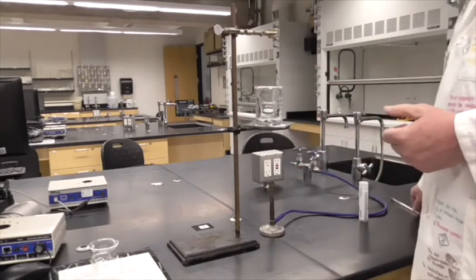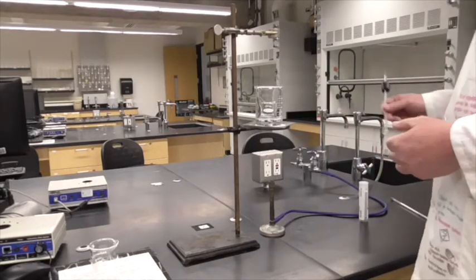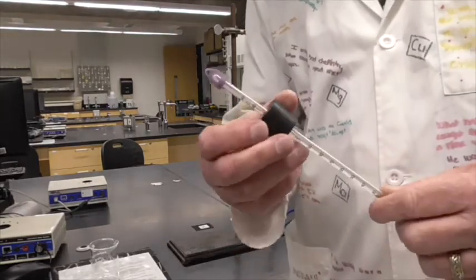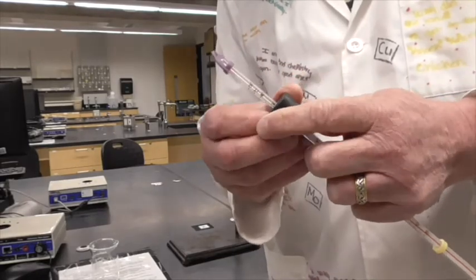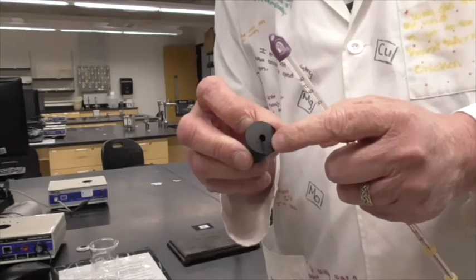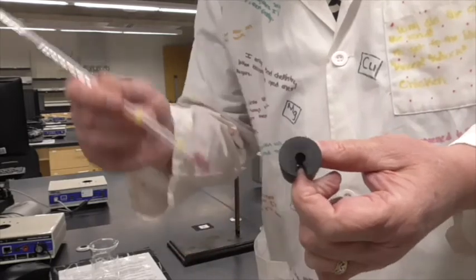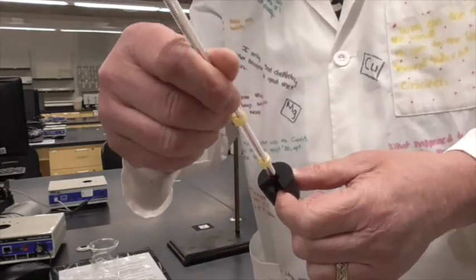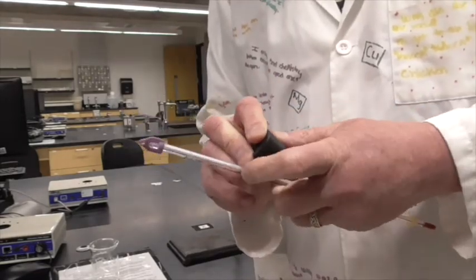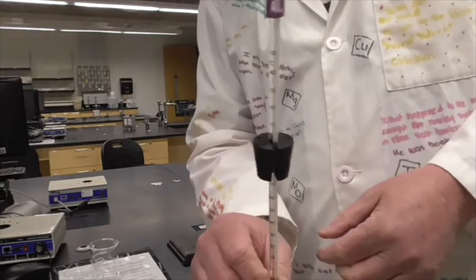And for the melting points, we're going to heat the water until the sample melts. We'll be using a thermometer, and we're going to use what's called a split stopper. So our stopper here has a hole in it, but then it's cut. What that does is allow me to open it up and put a thermometer in there really easily, without having to force it into the hole. I can just open up the split and get it around there.